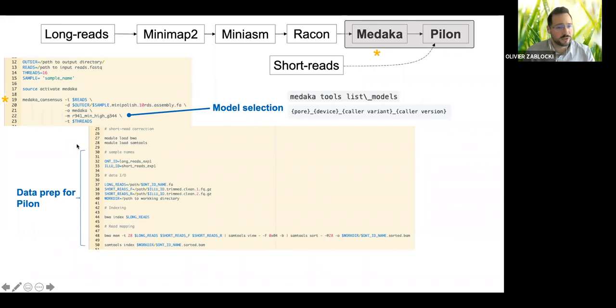Here, just examples, of course, you do what you wish for this to be the clearest to you in your code. But this is basically the names of the data sets for ONT, so the long reads, and Illumina ID here. You just want to make sure that you have the correct corresponding short read data for your long read data if you have these data sets.